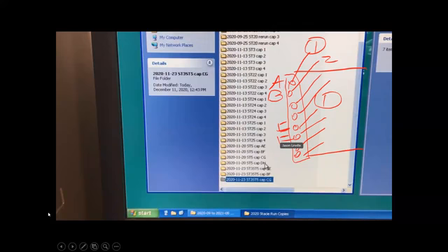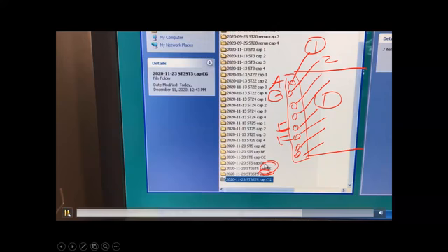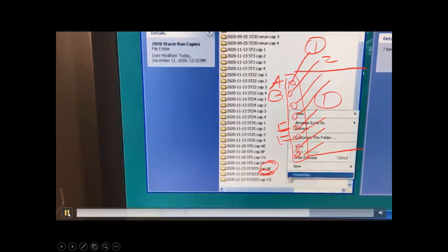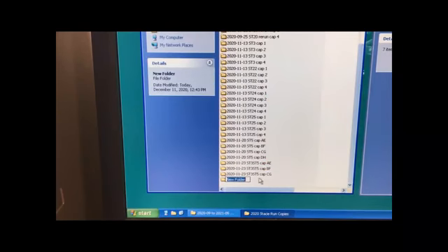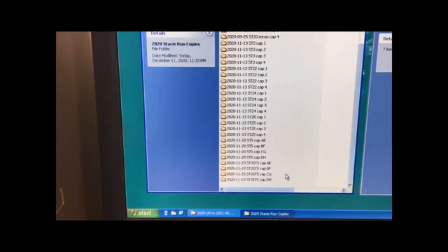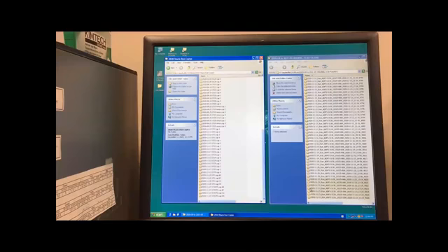So you'll notice why I'm creating those capillaries down there. I have one for AE, one for BF, one for CG. And then the last one, what do you think it's going to be? DH. Okay, this is going to be the easiest way to do it. You create 4 folders for that day, and then you name them with the row, because as we're going to see, that's how your files are named.